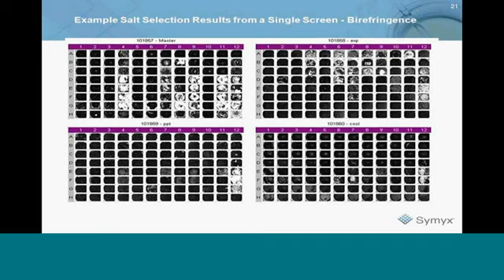And so, in some cases, we actually look for conditions that give a crystal size and shape that is more convenient and something that would be more optimal for processing conditions. And again, you're looking within the same polymorphic form and either trying to find the conditions that would generate that form or generate that form more efficiently, if that answers the question.